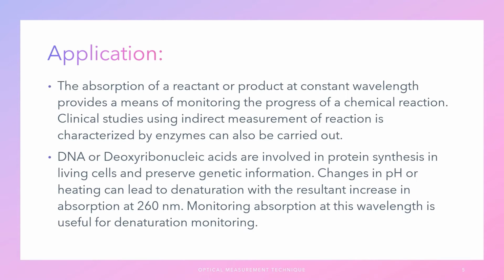DNA, or deoxyribonucleic acid, is involved in protein synthesis in living cells and preserves genetic information. Changes in pH or heating can lead to denaturation, with the resultant increase in absorption at 260 nanometers. Monitoring absorption at this wavelength is useful for denaturation monitoring.